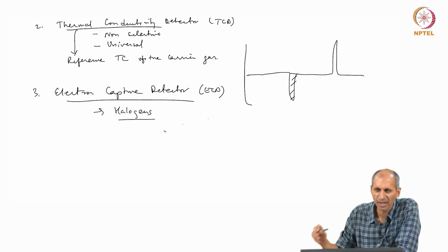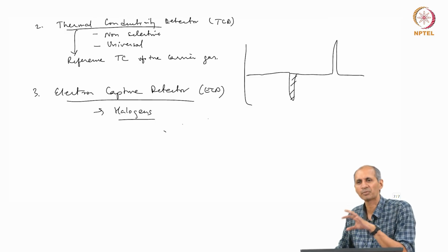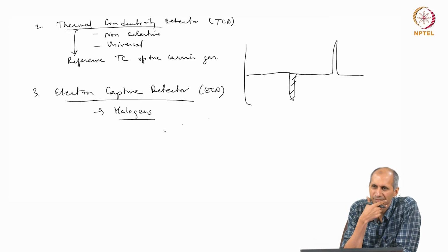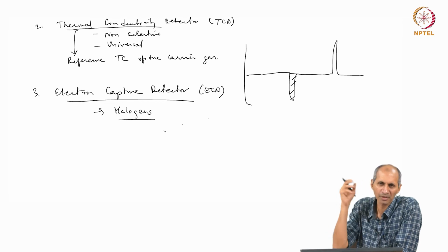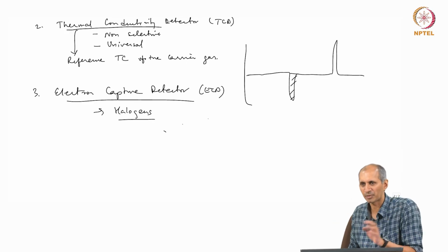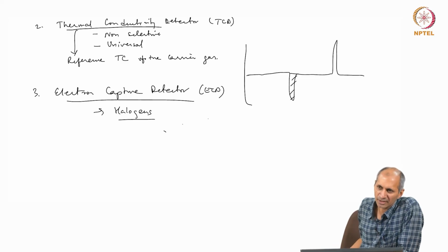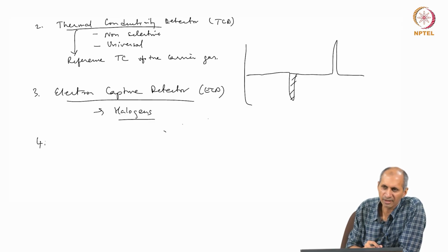Okay. But with all of these we have the same problem, we really do not know what the compound is. You have to do a lot of pre-processing, in a sense you have to know what it is that we are interested in, and this remains a problem throughout an analysis. Even if you have more tools at your disposal, you really need to know what it is that you are looking for, which means you have to have some information about the system. You can't just go blindly and say I want to know everything that is in the sample, which is usually an unreasonable and unachievable target.